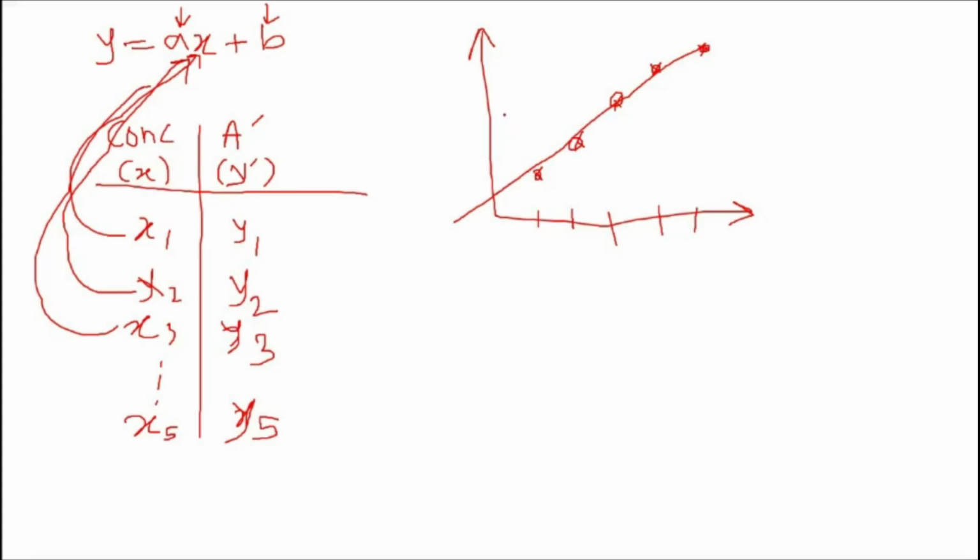Then you can take the reading for the absorbance of the test and interpolate to find the concentration. Now this is the ideal method. But what do you have to do in the exam? You need not draw all the points when you draw the line.